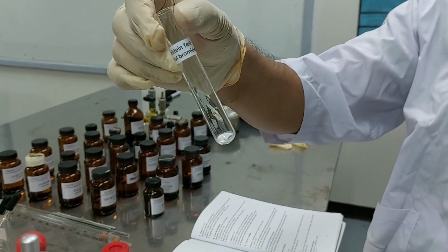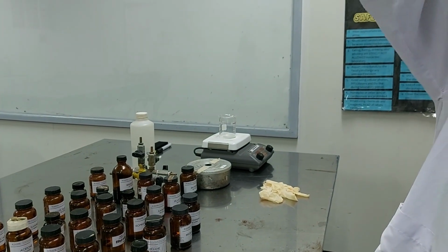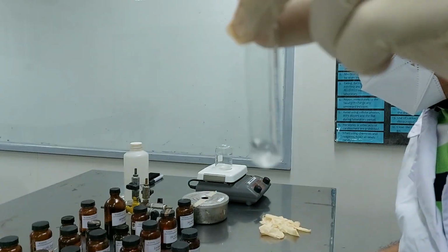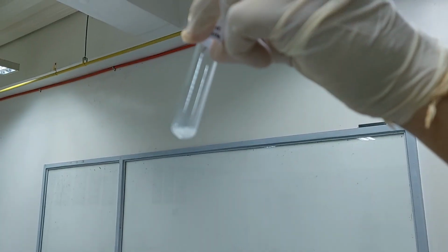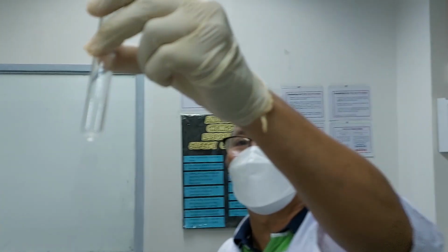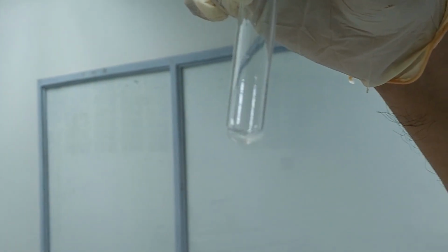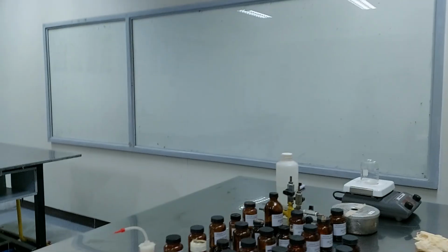The precipitate is not very clear, but you see the color, it's dirty white, right? We have to heat this one, no? In a water bath, but we can observe already, look at that, no? Even without heating, you see? The reaction is very slow because we are not heating it. But if we're going to heat this, we can observe the white, the creamy, no? Dirty white as what I described.